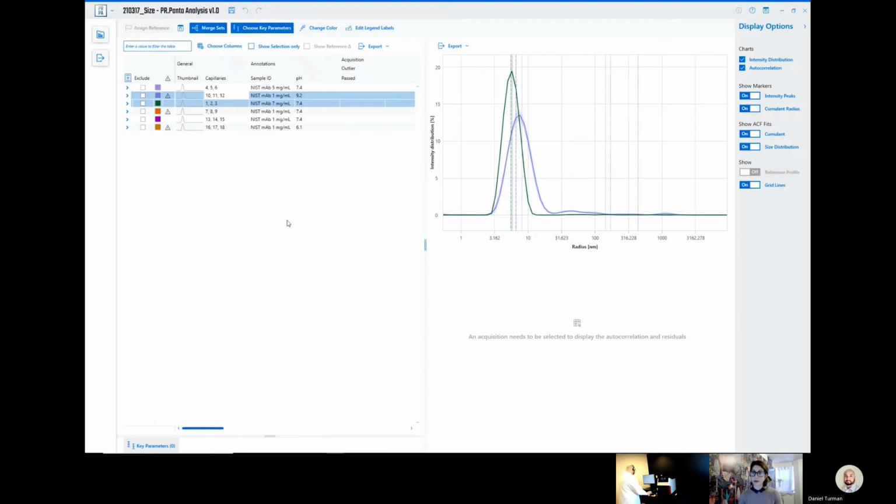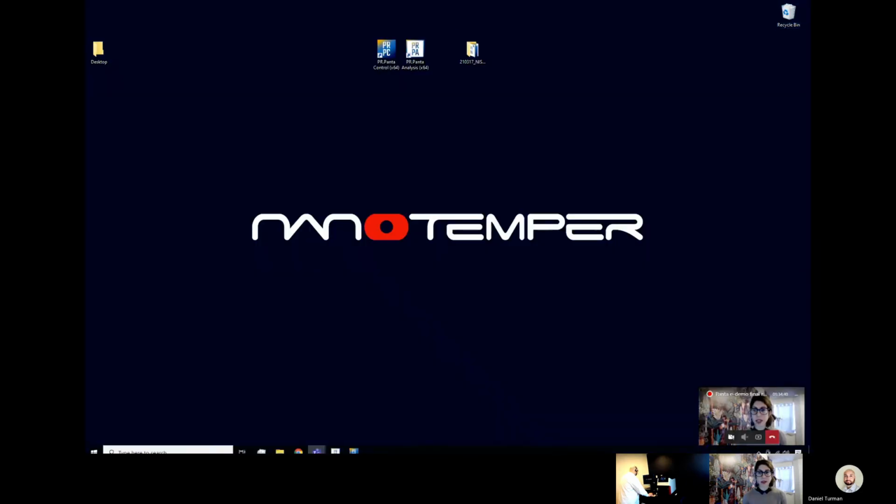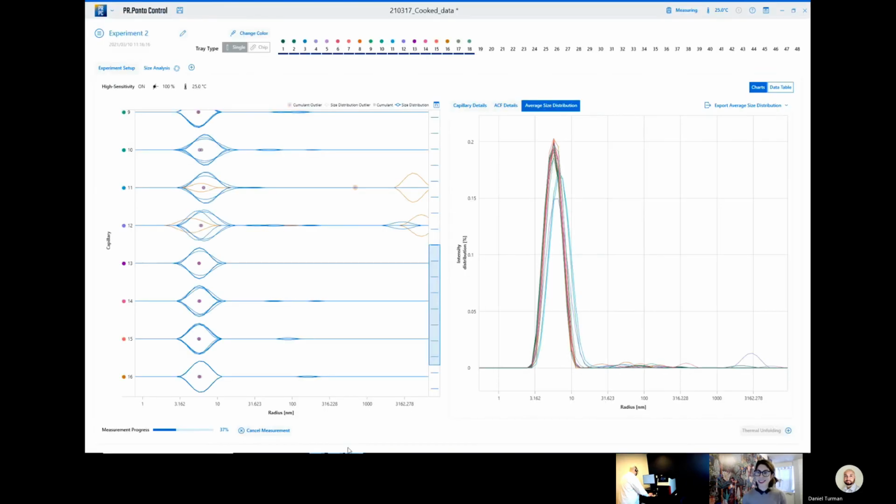Great. Did I miss anything with the DLS software? Leah? I think that was a great highlight. We can touch on some of the functionality of Panta analysis when we show some thermal unfolding data, but for the time being, that was excellent. Thank you, Dan. Yep, thank you.